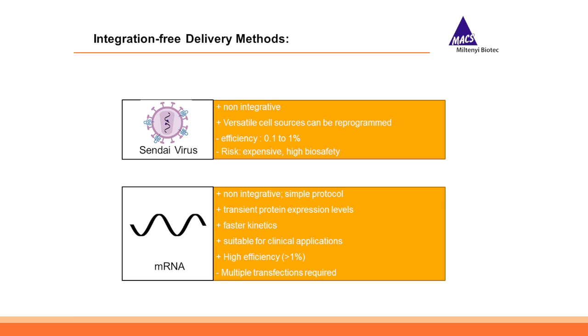The establishment of virus-free iPS cell lines requires up to 10 to 20 passages, depending on the cell line and reprogramming conditions, and you must isolate and clonally propagate at least 10 primary colonies to establish only a few iPS cell lines per patient sample.